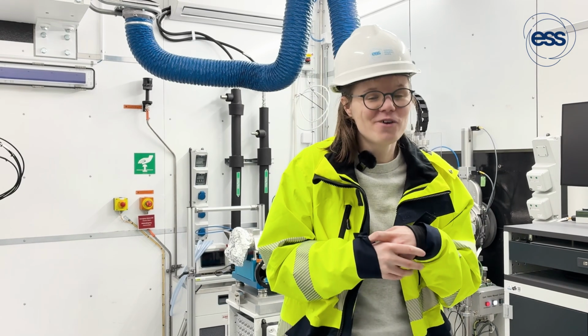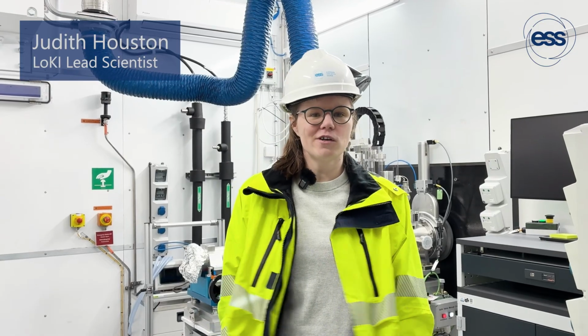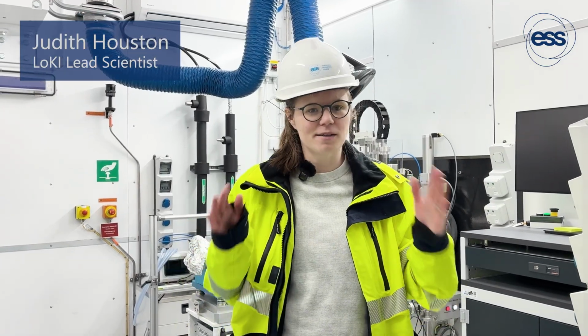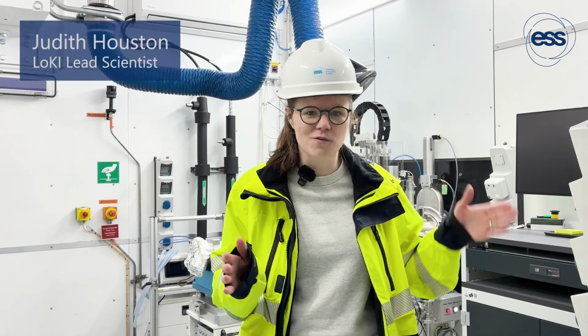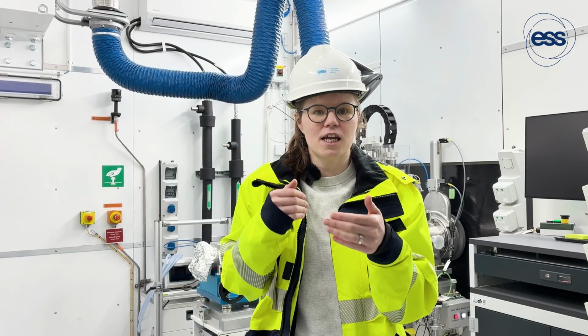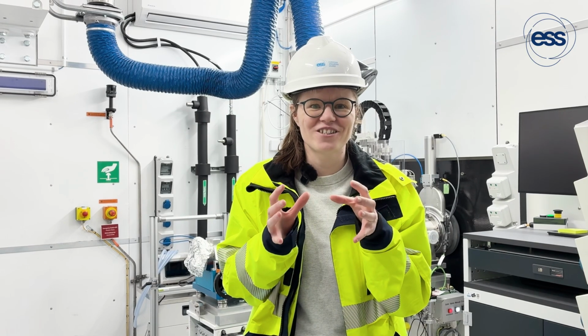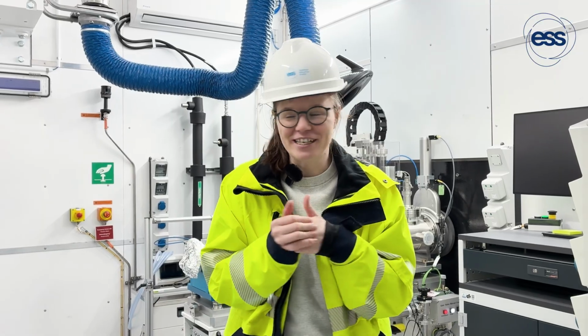Part of the reason that LoKI is so special is because we're all about the flux. We want more neutrons, we want to get as wide a simultaneous Q range as possible, taking advantage of the ESS source. And that allows us to, in a single shot, take images quite fast of our samples to understand our systems at a much shorter time scale than can be done elsewhere.